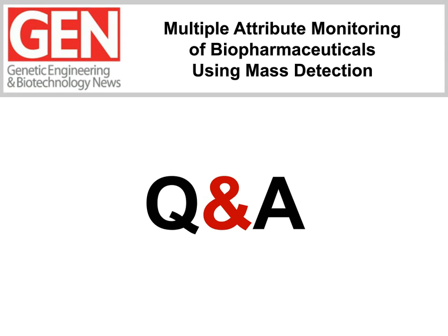Okay, great. Our next question comes from another audience member who asks, can you describe the performance options available for the QDA, specifically in terms of the pumping options? So the QDA is available in 2 different pumping options, referred to as standard performance or high performance. At a basic level, the difference between them is the type of vacuum that is used. In the standard performance, it's a diaphragm pump that sits on the back of the instrument.